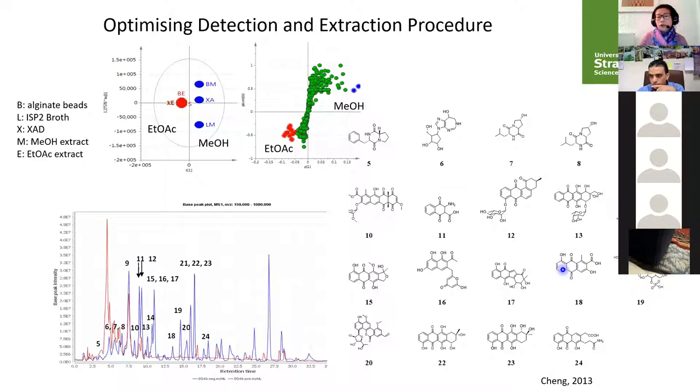If we only use positive mode, then we will not be able to see these metabolites. So our first hypothesis will now state that the bioactive metabolites belonging to the ethyl acetate are made up of anthraquinones.